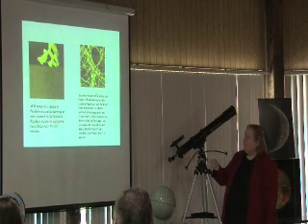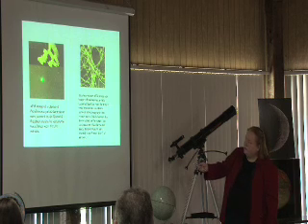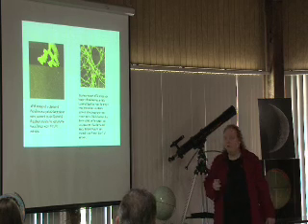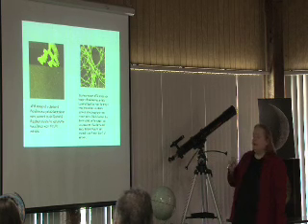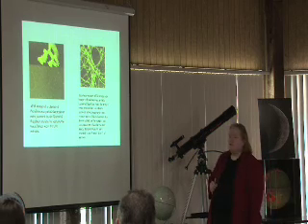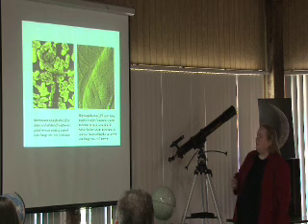This is bacteria, more bacteria, views of bacteria and the flagella of the bacteria. You see these spirals along here? They're what wiggle and propel the bacteria around in solutions. You can do a zoom in close-up look at those flagella. You can't see those with a regular optical microscope. They're much too small. And here's some more biofilms.